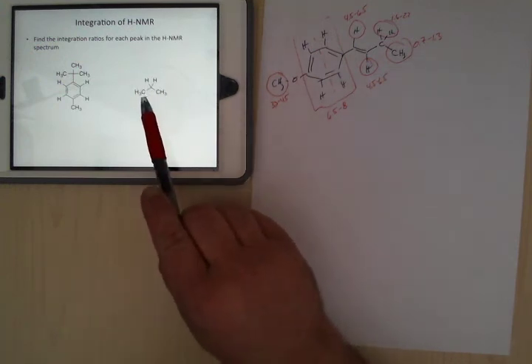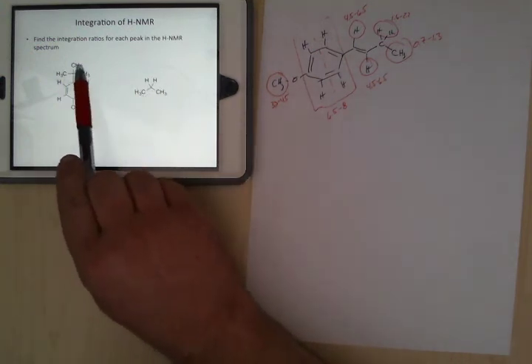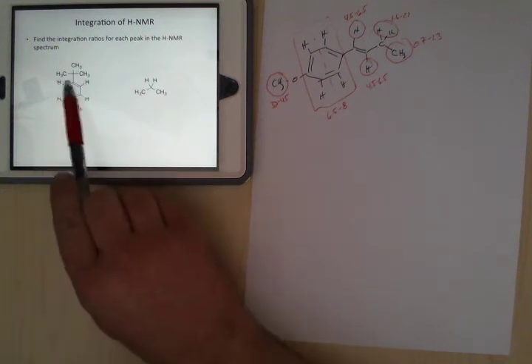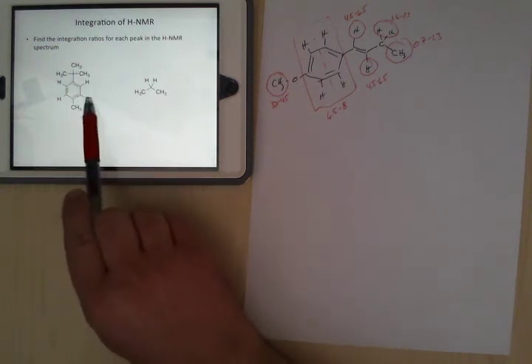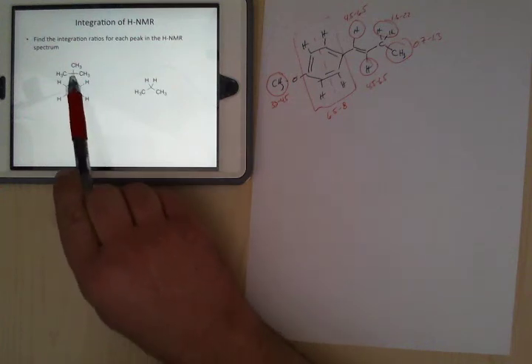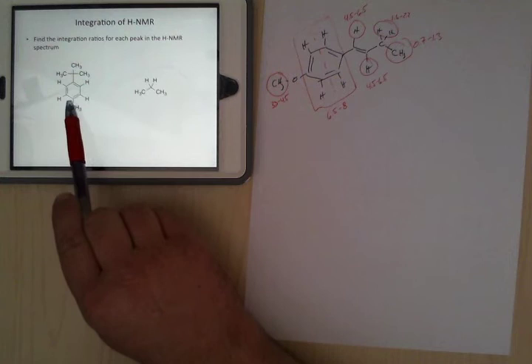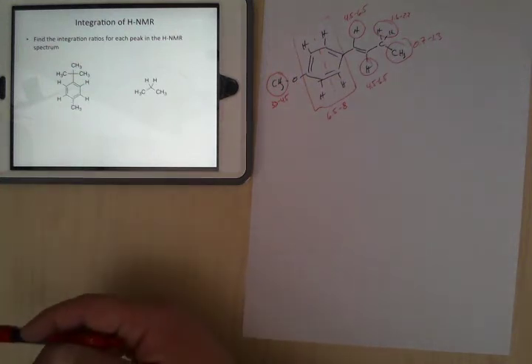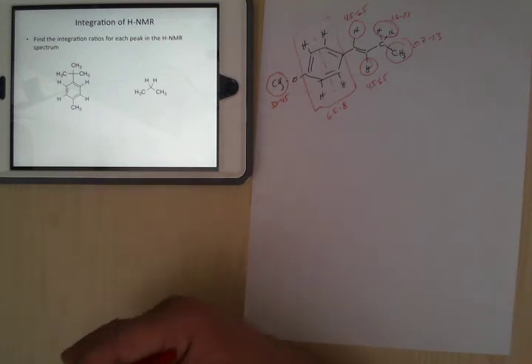So, like that. It would be these. You would get a 9 hydrogen signal, a 2 hydrogen signal, a 2 hydrogen signal, and a 3 hydrogen signal. This carbon here wouldn't show up, nor would this one, because there are no hydrogens off of them. So we would only see those in the carbon NMR, but not the hydrogen NMR, because there are no hydrogens coming off of them.